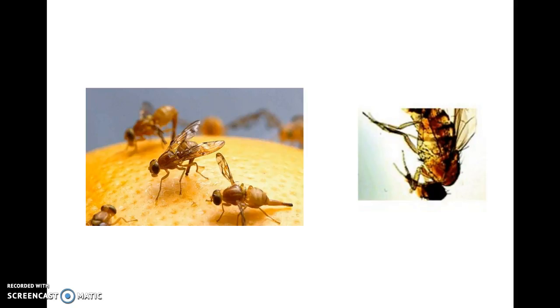And the fruit fly eggs are incredibly tiny. They're on the skin of the fruit, and you don't know they're there. They camouflage well. They're really tiny. And you bring your fruit home from the grocery store. A day or two later, you have fruit flies hatching out. Usually not really a big deal, just kind of a nuisance. But they're a very common subject to look at under the microscope.